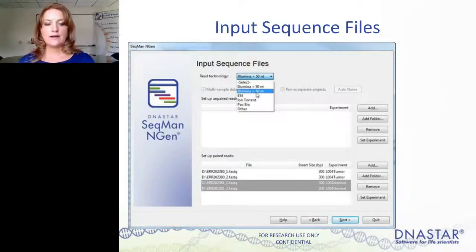Down here I'm going to give these paired reads names so that we know that we have the tumor data together. So I give each read a matching name, and we have some tumor sample data from patient number L004, and then we have 2 sets of data that actually came from blood from that same patient.